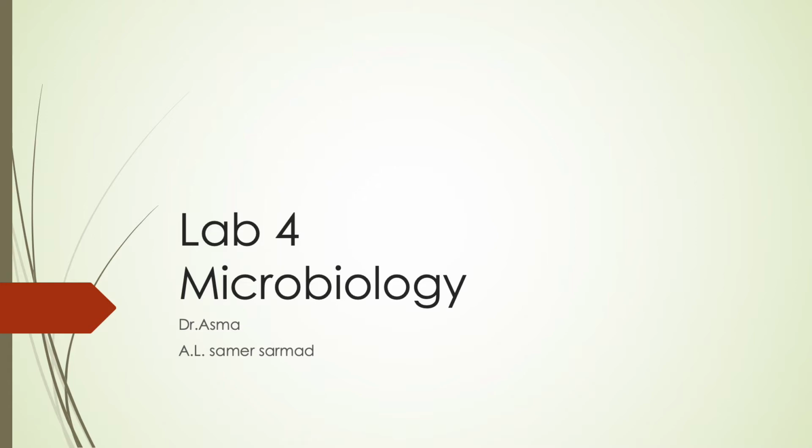So it looks like if we want to start with culturing some specific bacteria, we need this introduction, and we need to know what the culture media is and what techniques are used to culture the bacteria.